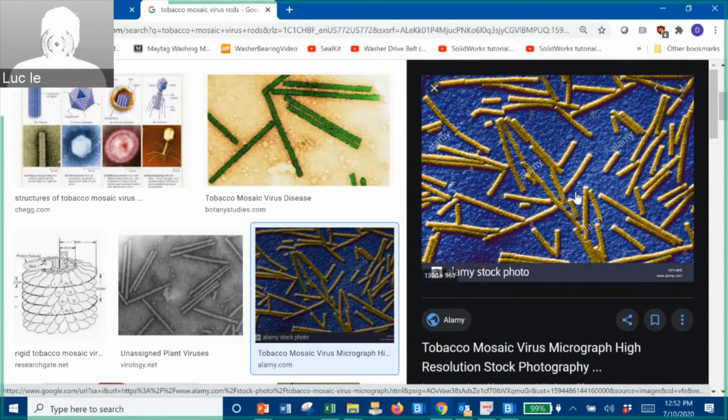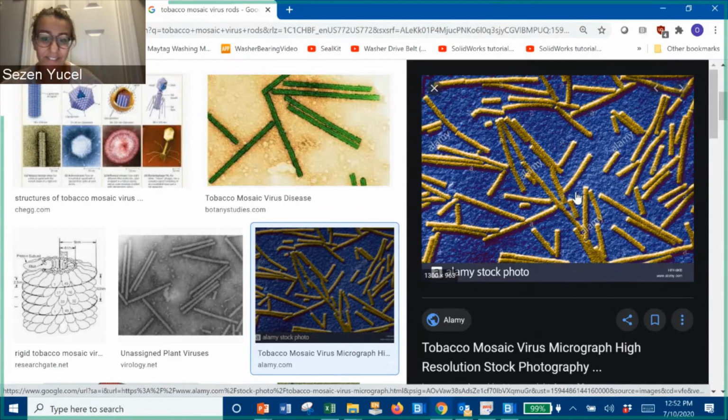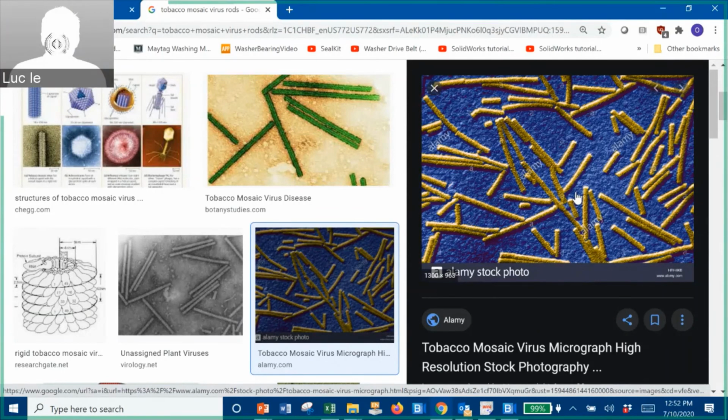Yeah, my code certainly will give way more information compared to the CNC images, because as you said, the widths are almost the same for each object, and the lengths have a maximum length possible. So they are also very limited compared to the CNC size distributions.